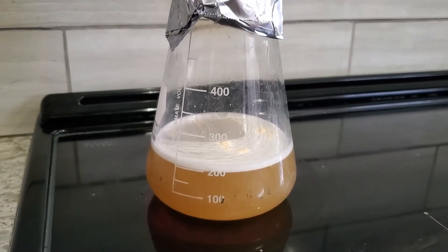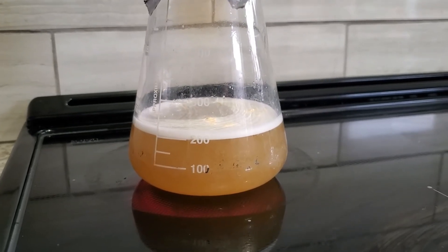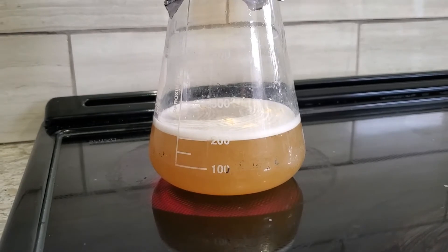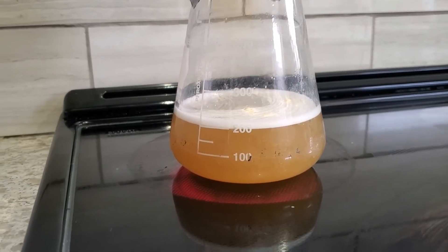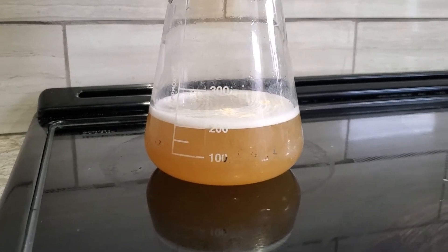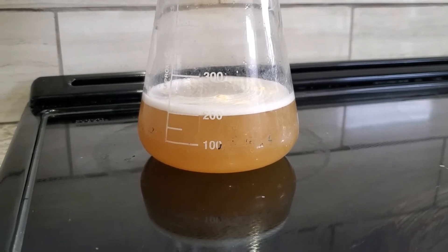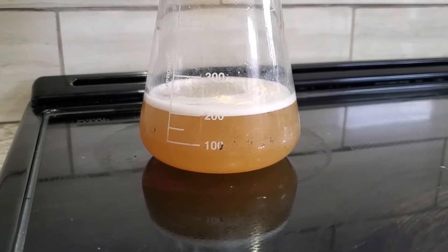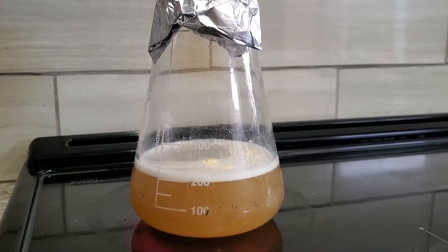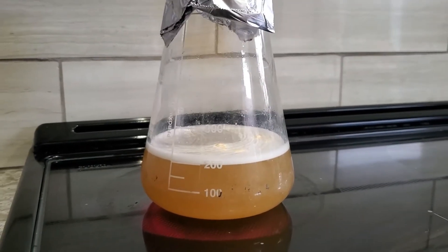I've got this on really low heat just to make sure I slowly approach a boil. A few things to bear in mind: the defoamer and the low heat will help prevent a volcanic eruption, which would be disastrous. I was also very careful to make sure the stovetop surface is clean and the bottom of the flask is free of any moisture, because anything there can crack the flask — and especially as you get into the larger flasks they get quite pricey. We'll come back when this is hitting a boil.